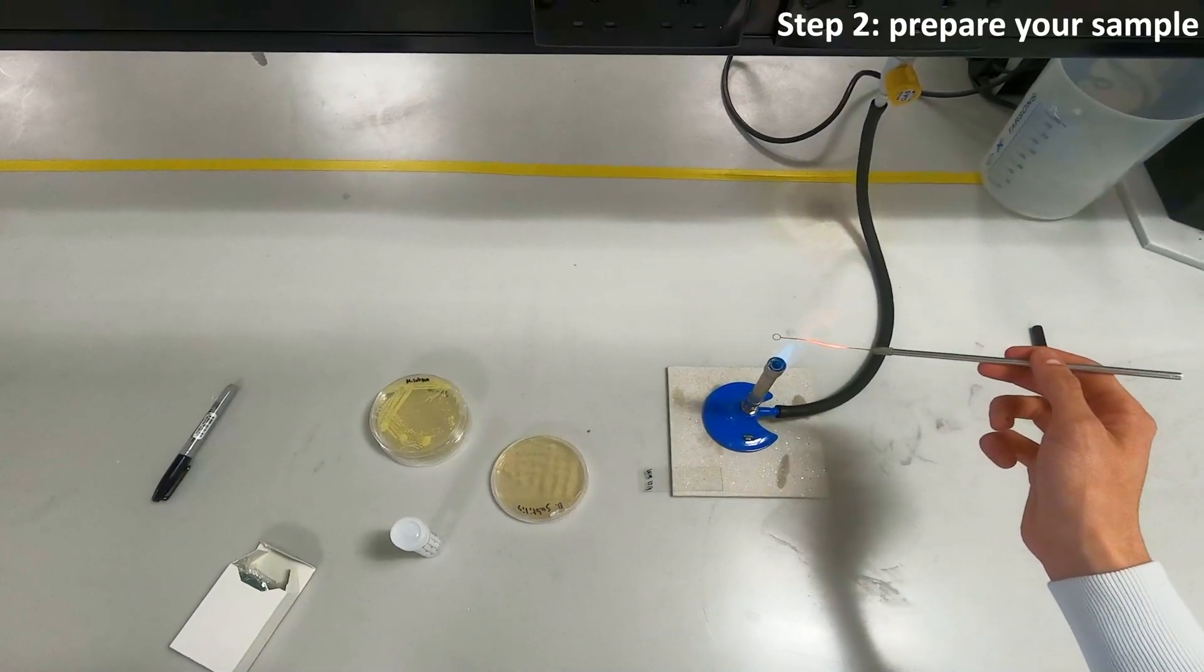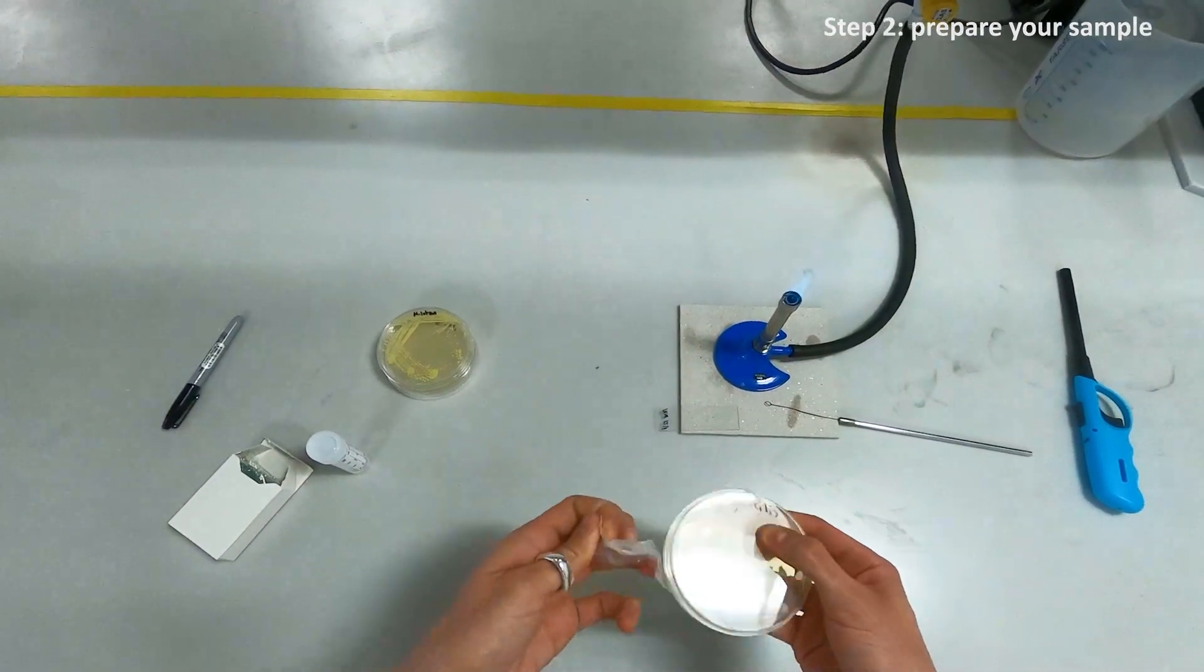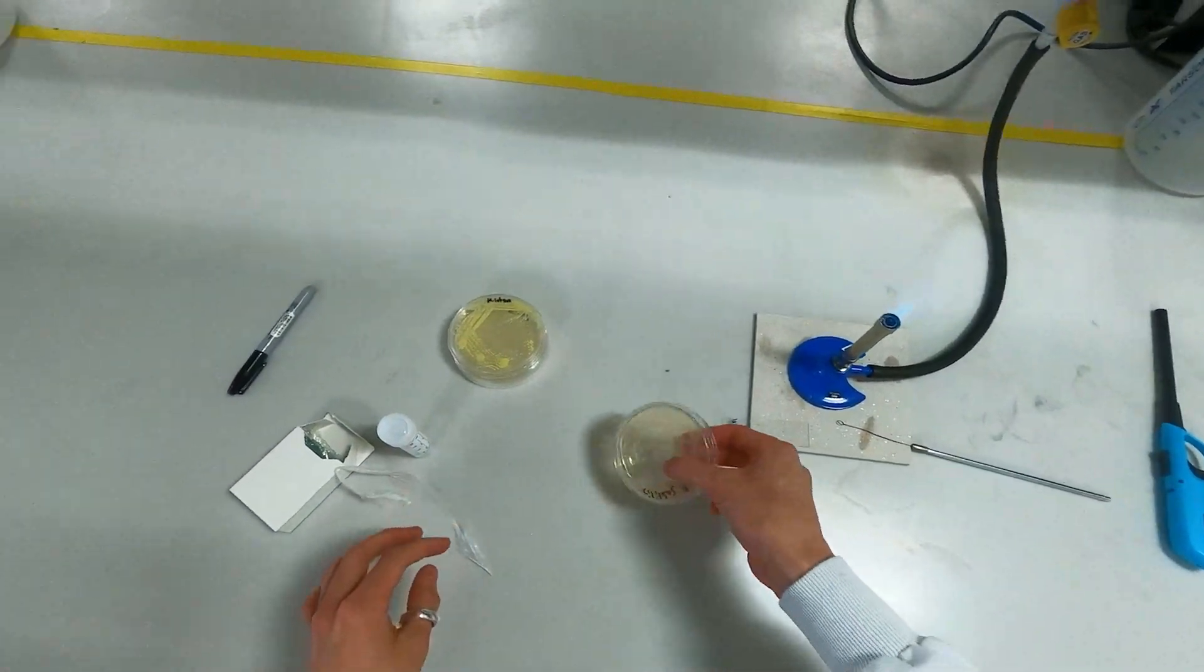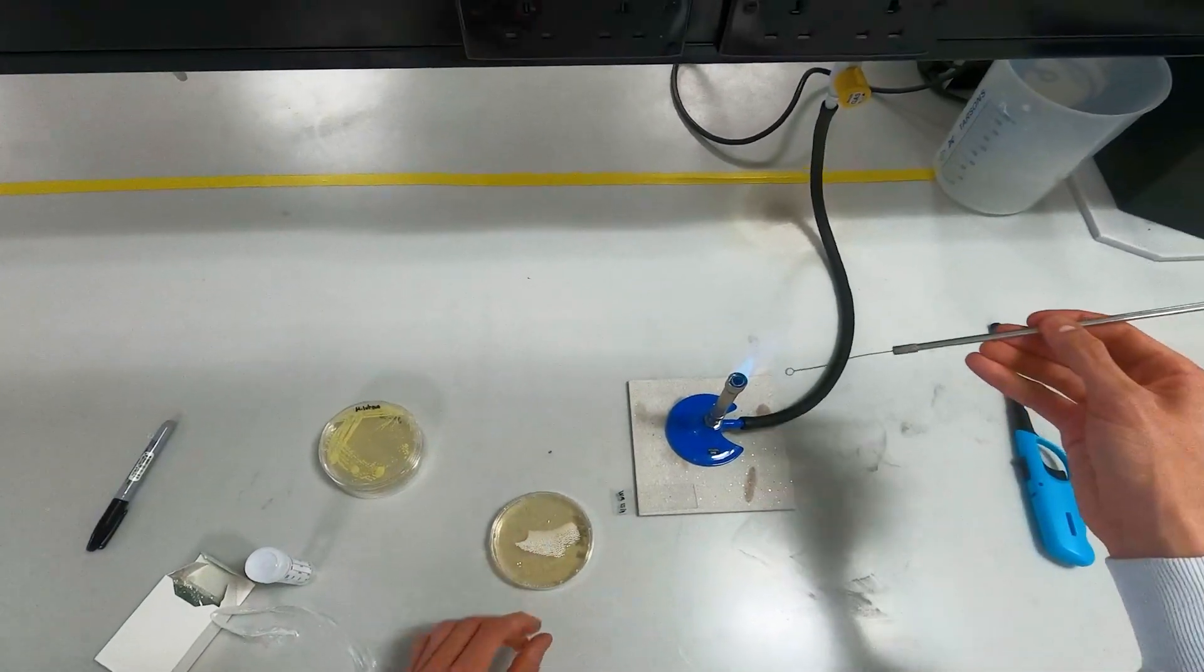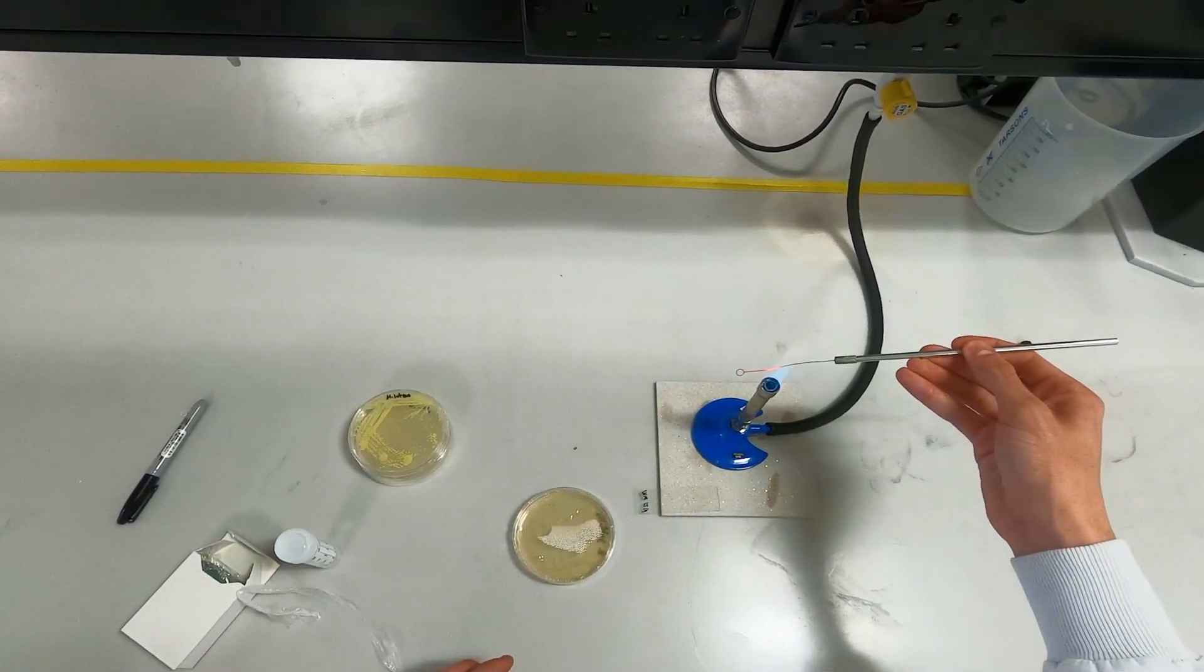Now take any tape you might have off your plate so you're ready to take a sample from it. Place it appropriately and flame your inoculation loop before you pick up any sample. Also make sure it's cool enough - you don't want to damage your bacteria.